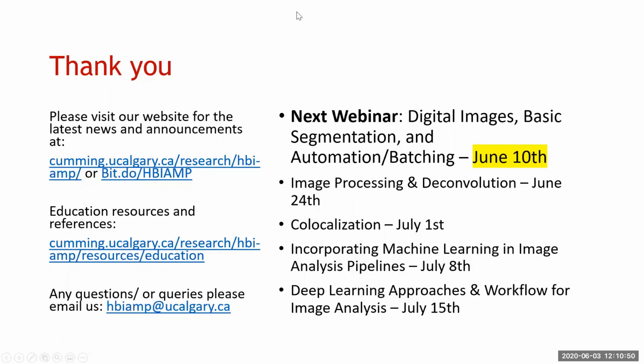That being said, a black and white, 1-bit image, where it's either black or white, is the highest contrast you can have. So if you shrink your histogram, usually it leads to higher contrast. But if you want to differentiate different structures that have different light intensities, then you need a few more counts, or to spread out that histogram.